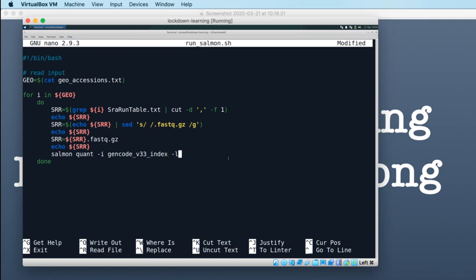We want the library type to be automatic, so -l, that's a lowercase l, not a 1. It's a thing we run into a lot on the courses that we run: you get a lot of errors when you write these scripts, because in some fonts it's really difficult to tell the difference between l's and 1's. Actually, in the default Ubuntu terminal font it's really not that bad. L and 1, I'll put the 1 next to it, look really quite different. But it can be tricky in some fonts to tell them apart. So it's -l, capital A.